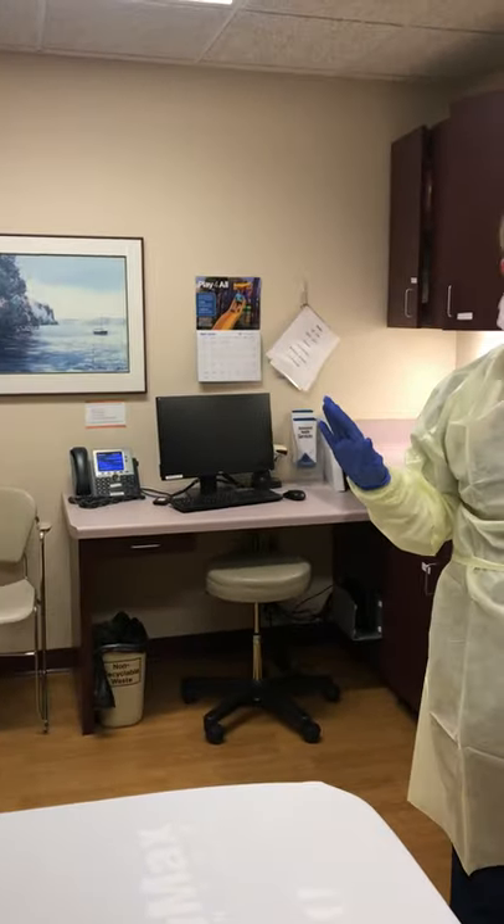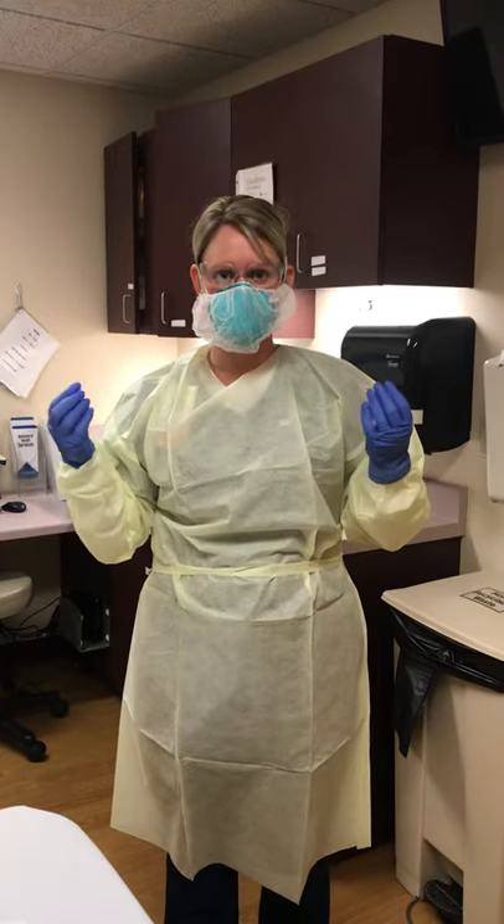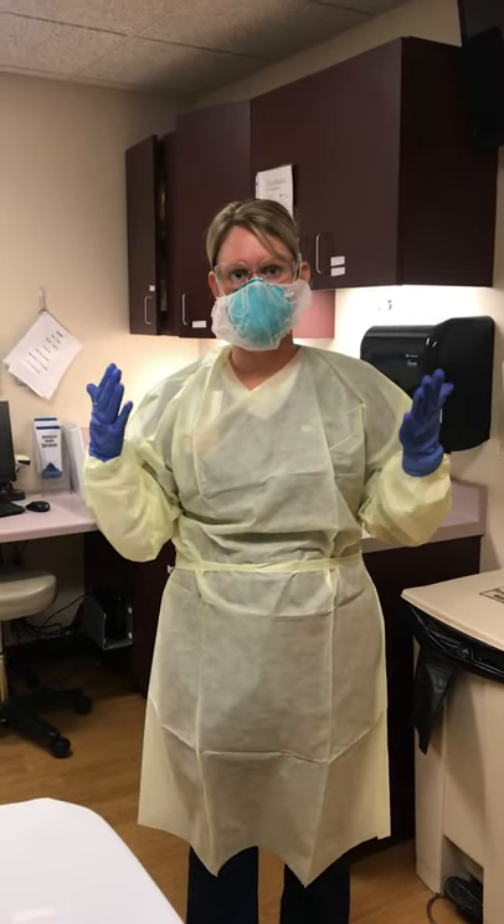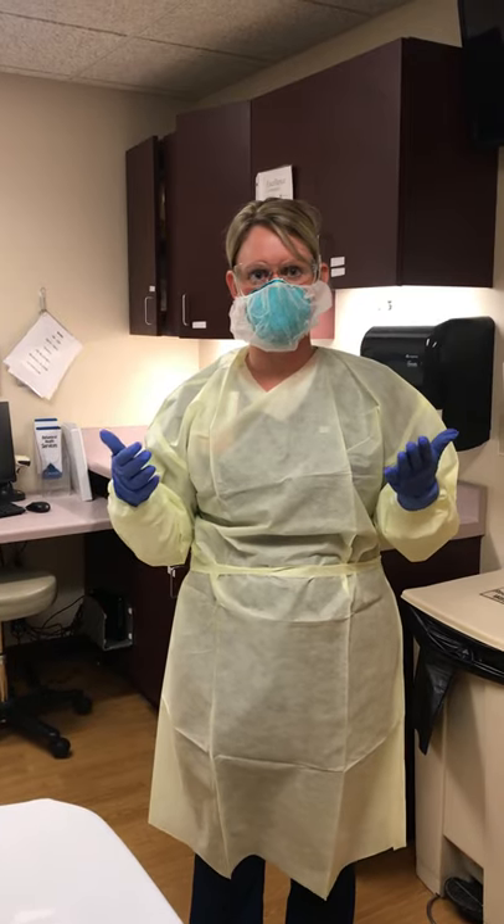I am in the room. I have my full PPE. I provide my patient care. When I have completed my patient care, I am going to doff — but we do not have an anteroom here, so we're showing how we can doff without that anteroom.